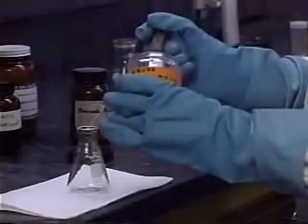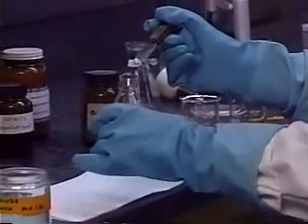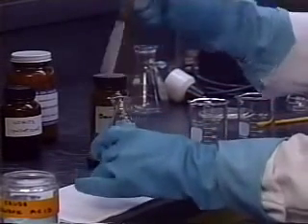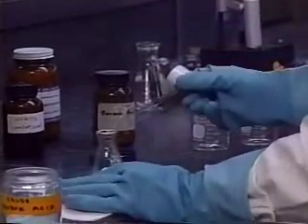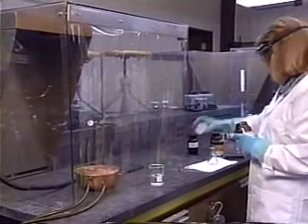Place the benzoic acid in a small Erlenmeyer flask. The literature references state that pure benzoic acid is white. The material we see is appreciably colored, which is a sign of an impurity.